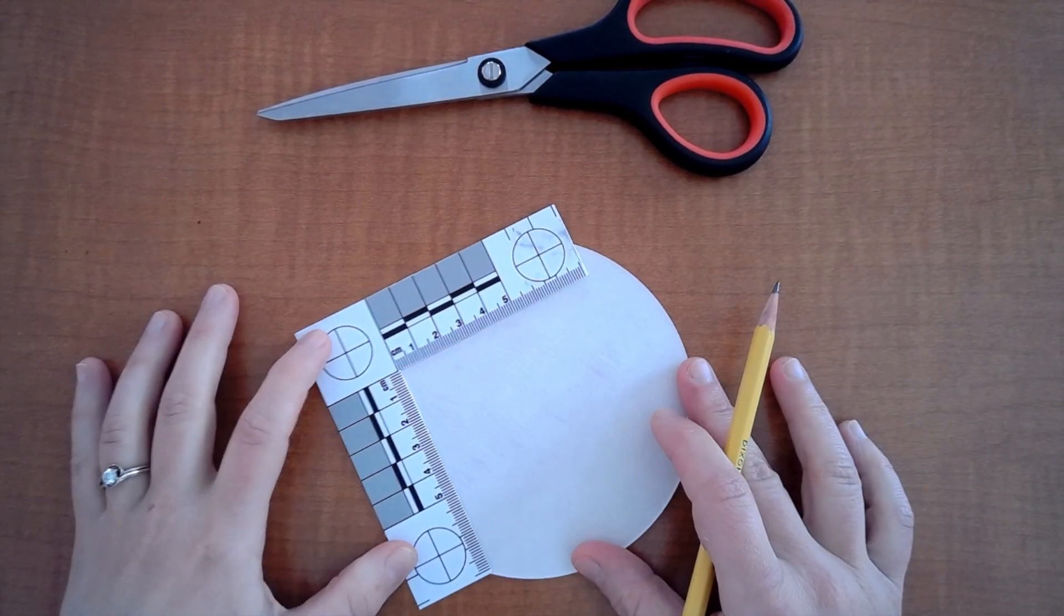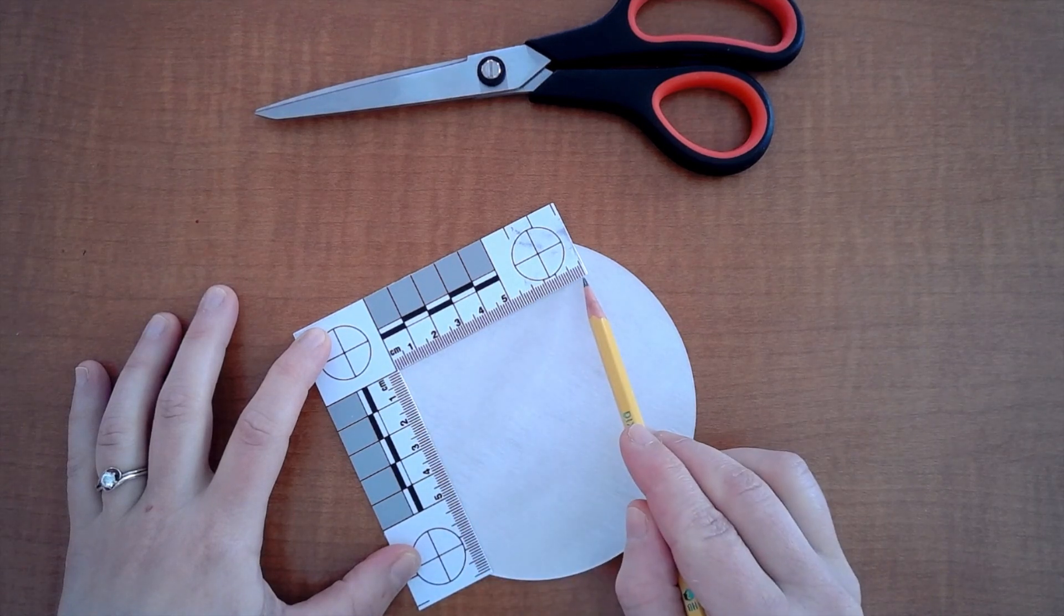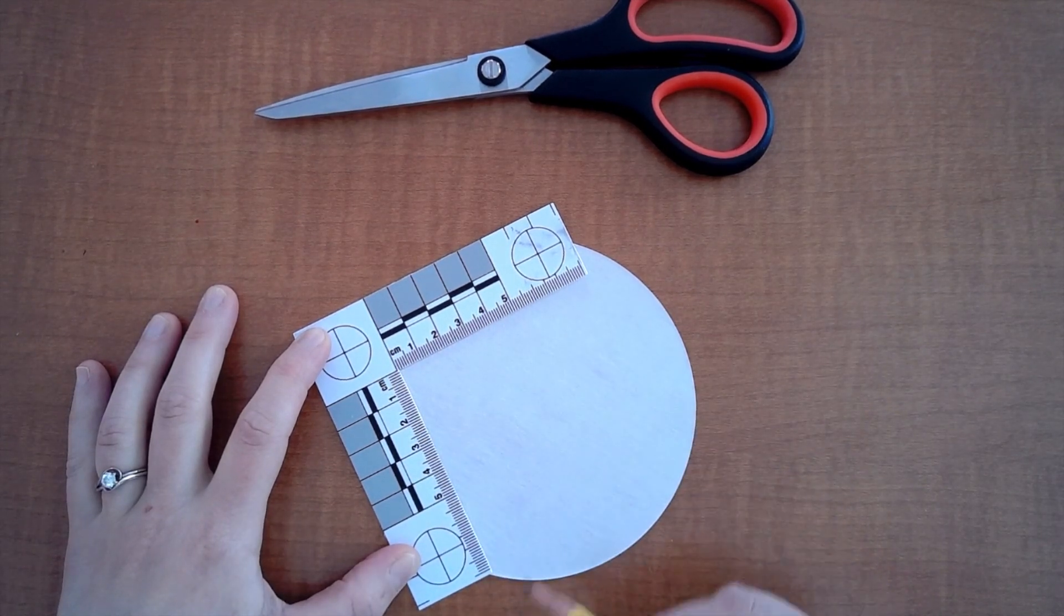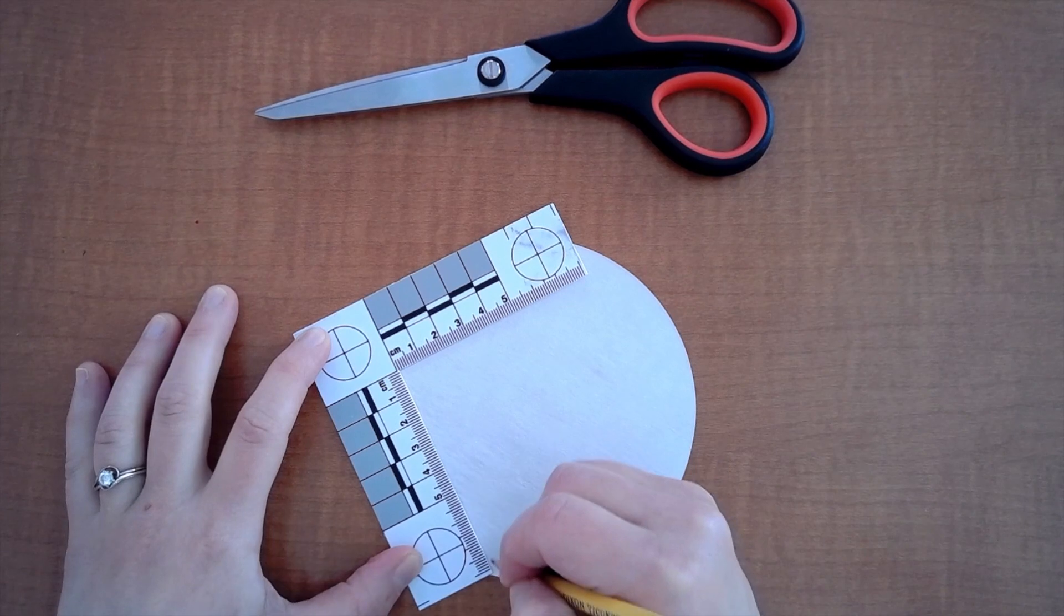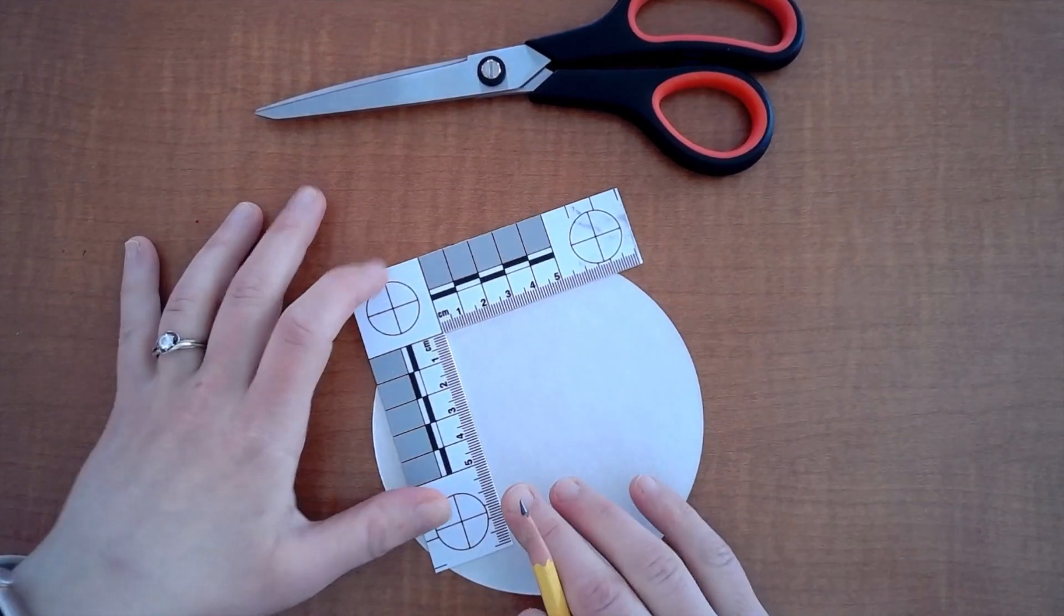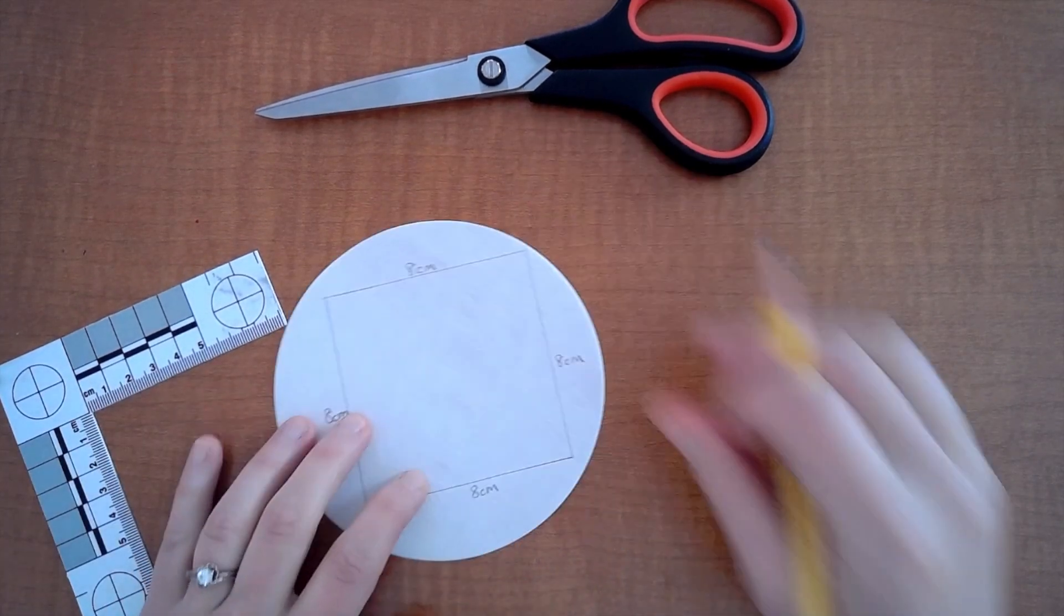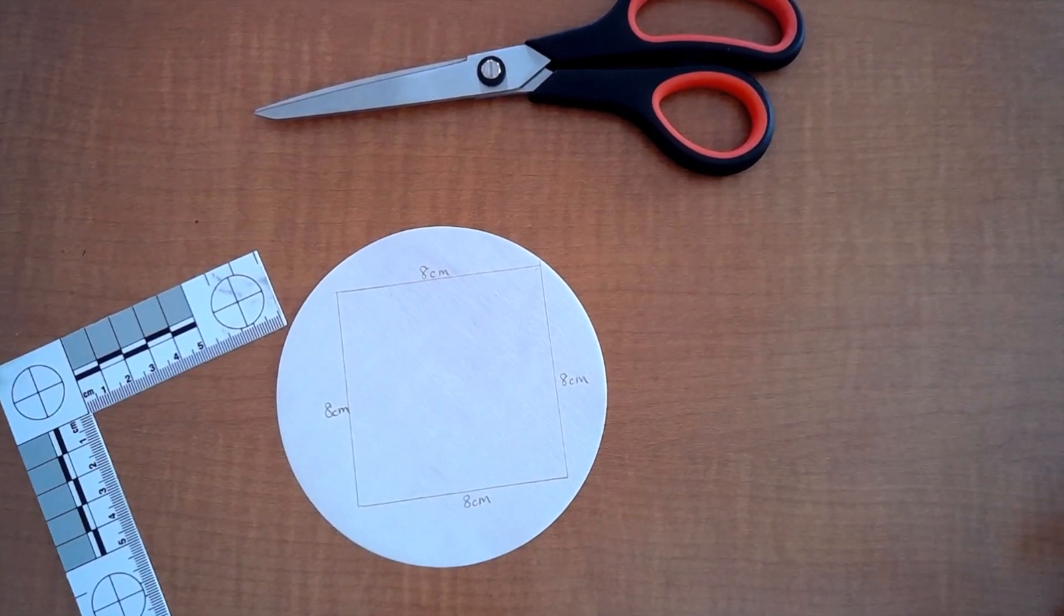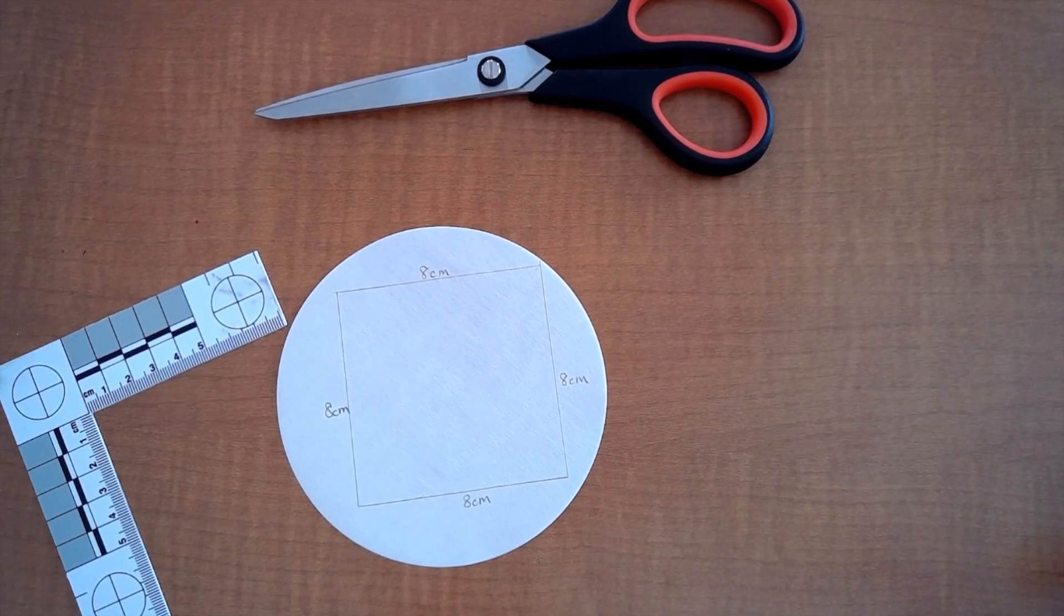Why is this L-shaped ruler amazing? Well because from here to here is actually eight centimeters and from here to here is eight centimeters. So if you trace the L on one side and then move it around and trace you will get an eight centimeter by eight centimeter square.